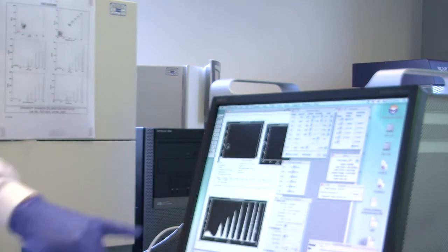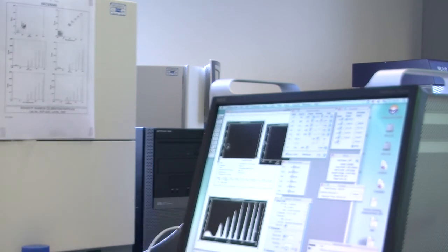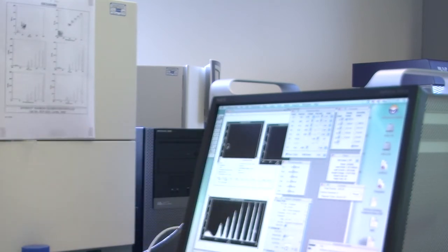Now, what we can actually do then, we could put a marker region on here to look at this one's median fluorescence and this one. The median fluorescence is how bright that population is. The higher the number, the brighter the population is. The brighter it is, the more fluorochrome it has. The more fluorochrome it has, the more antibody it has. And the more antibody it has, the more of whatever it is the antibody sticks to is there, on or in that cell. Okay? So, if, for example, our cells came out here, they're going to be absolutely loaded with our protein of interest.